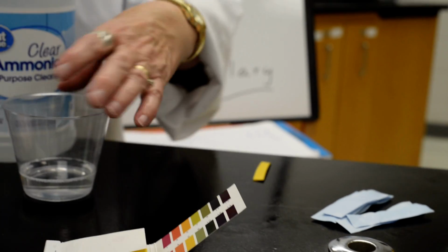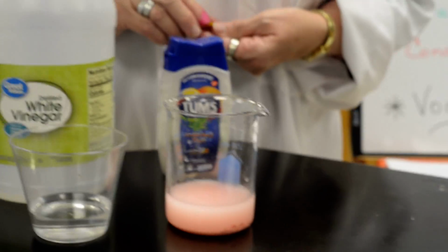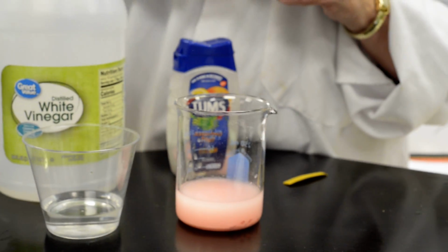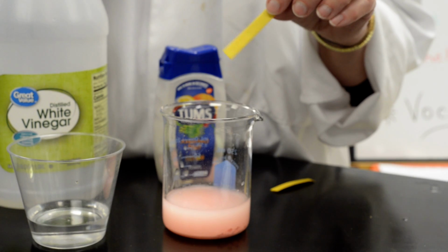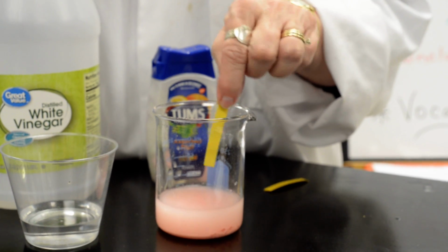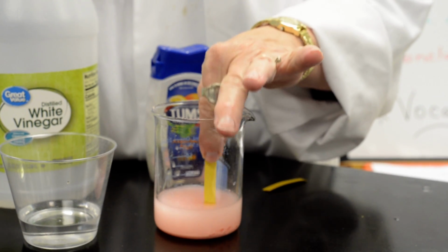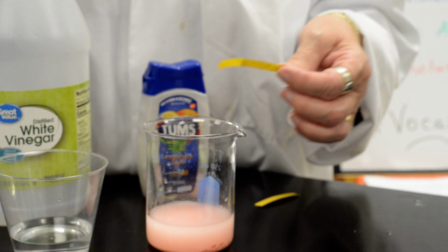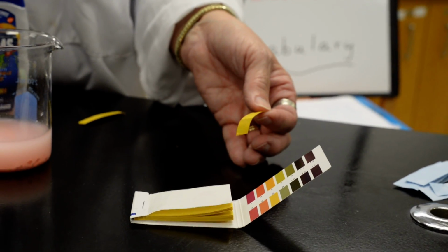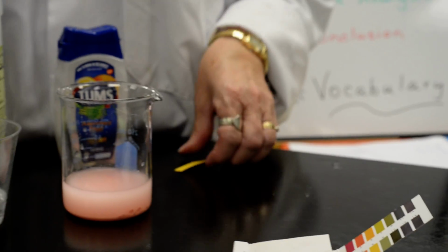Then this one is Tums. You could also use Rolaids, those kinds of things. And you take them when you have an upset stomach, so making a prediction about this might be a little easier. I put it in water just so that it shows up a little, made it dissolve a little quicker. Okay, so obviously what it's supposed to do is neutralize the acidity in your stomach. So you can see that very neutral because it takes care of the acidity in your stomach.